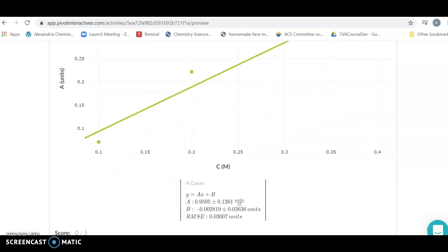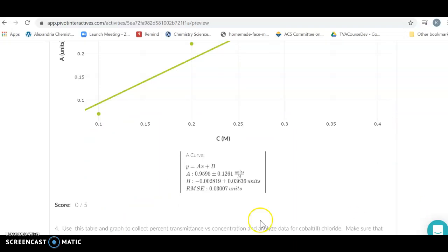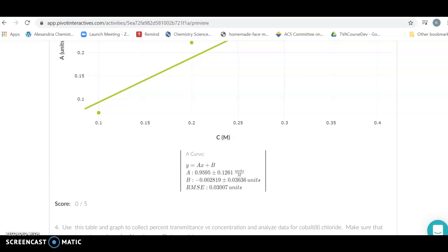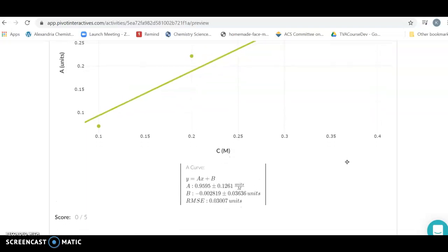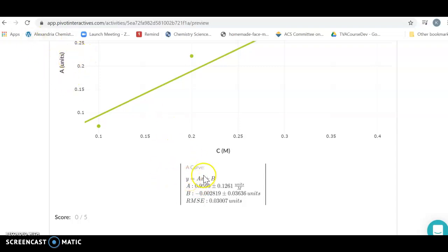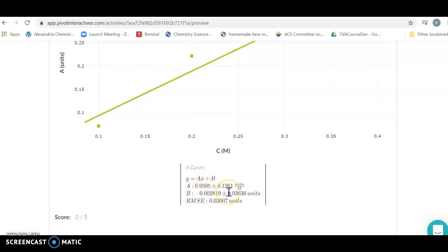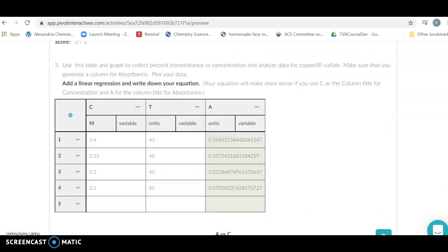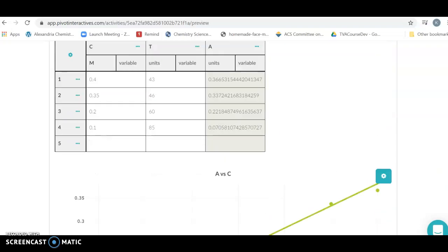I have a fit here, it's a mediocre on the linear but that's all right. What is going to come out of it is our best fit line. We have a best fit line that's going to tell us where y equals mx plus b. Our y is going to be our absorbance, our x is going to be our concentration, and a and b here are where a is our slope and b is our intercept.